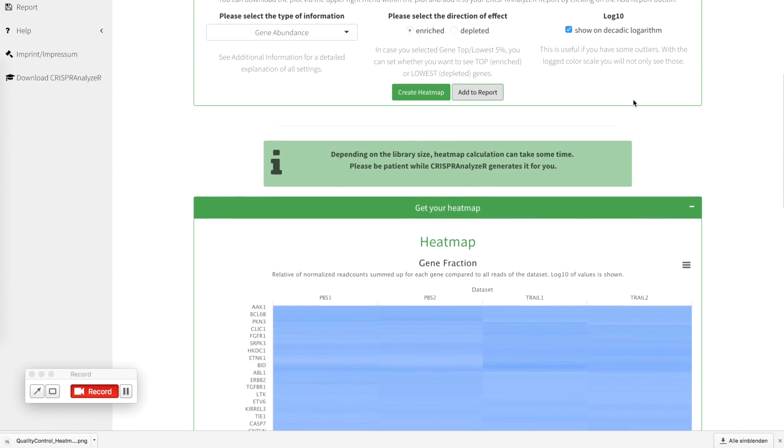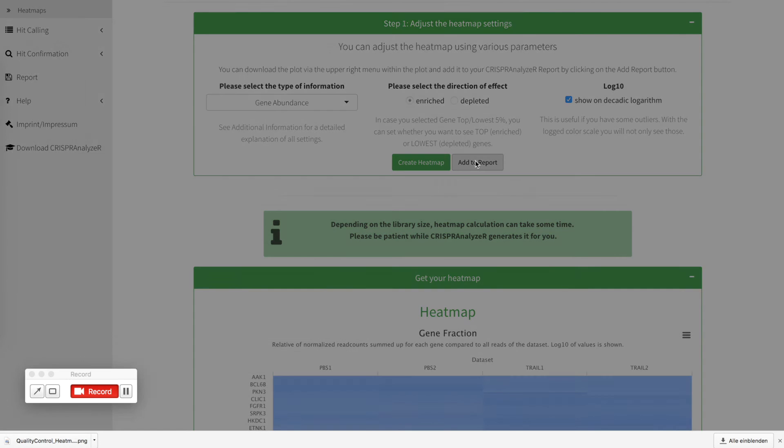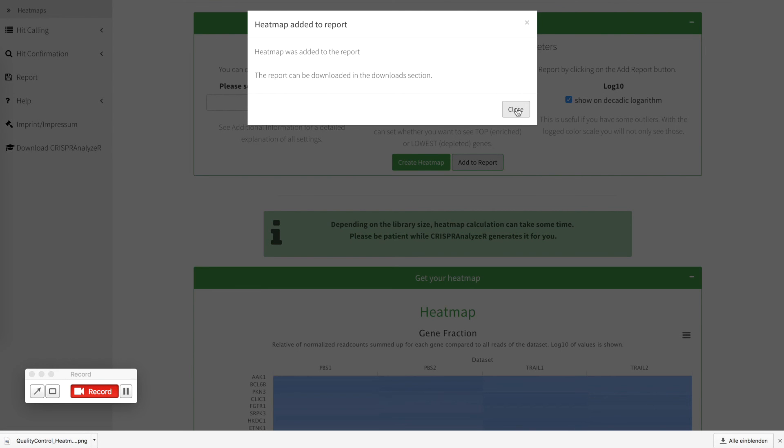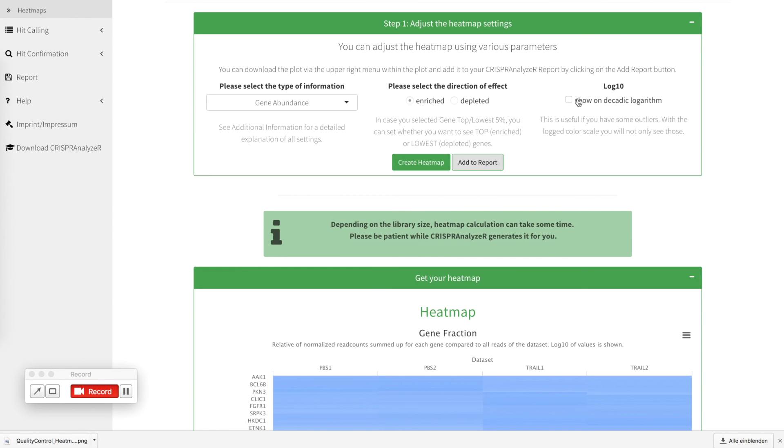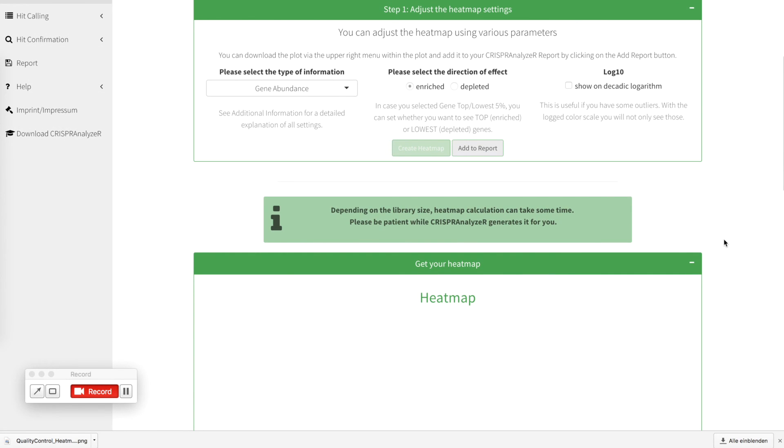If you don't want to have this as a log10, you just click inactivate it. If you want to have this plot as it is in your report, you click add to report, the heatmap is added and then we can create the same heatmap without the log10 scale.